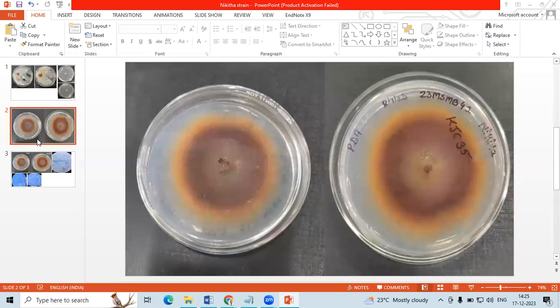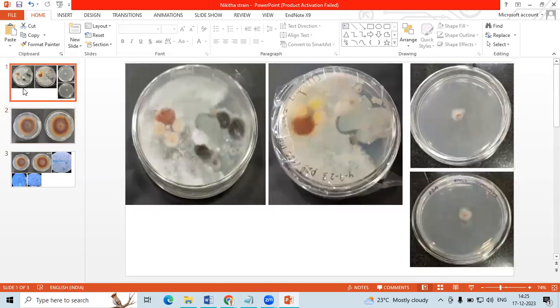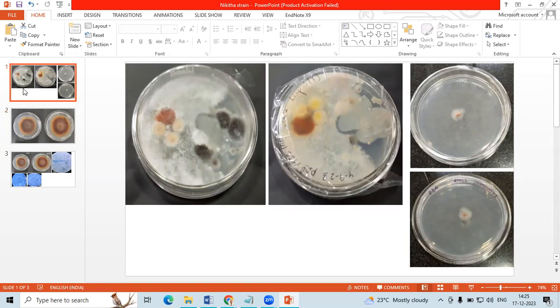In order to identify any fungi to species level, we need to go for ITS gene. Before that, we need to have all the traditional taxonomic data. So here I have a sequence of a strain KGC 35 that has been derived from an epiphyte of Catharanthus roseus.